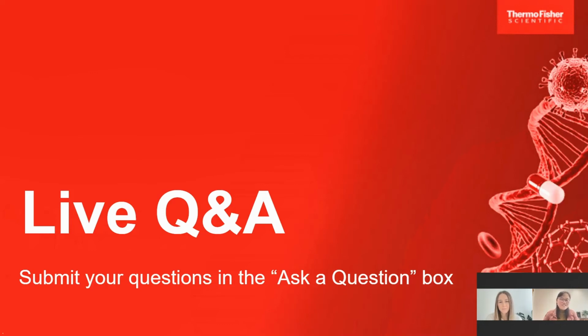So this is a very good question. We study environmental samples, especially water samples, in our lab. Depending on the characteristics of the samples, we have to choose different concentration methods. As I mentioned, membrane filtration is the most commonly used one because of the cost and the level of training we need to provide to new fellows in the lab. However, it also has very limited concentration factors. So we have to adopt different methods for different targets.